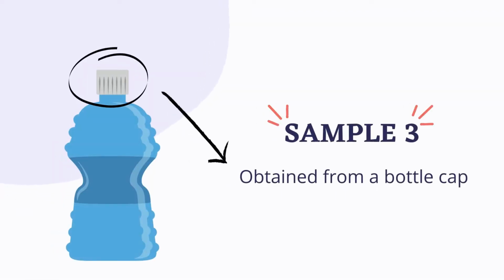Third sample, called sample 3, was also obtained from a bottle cap.